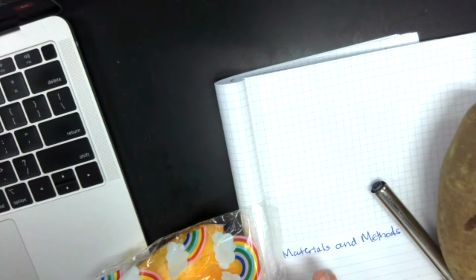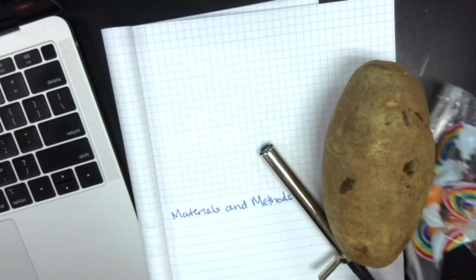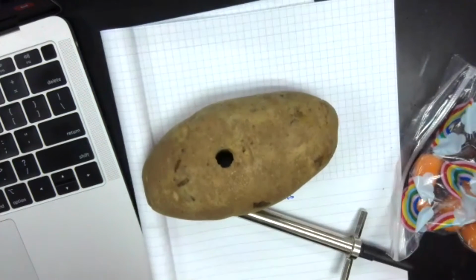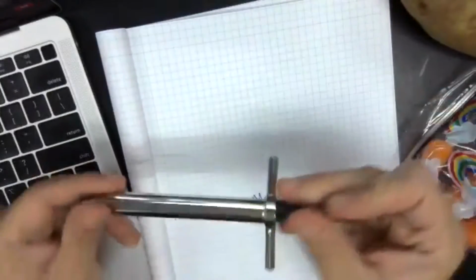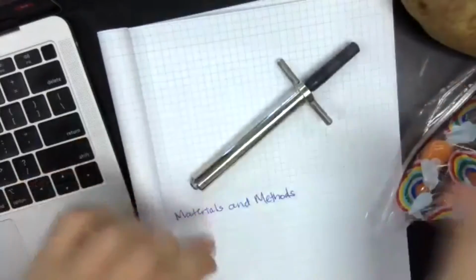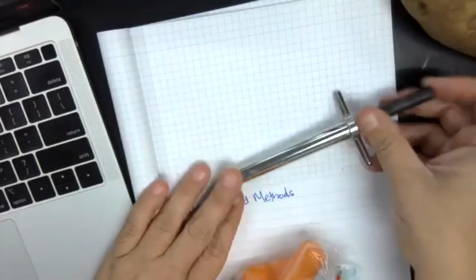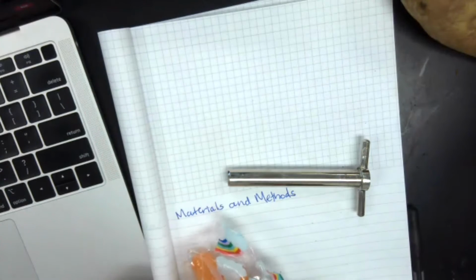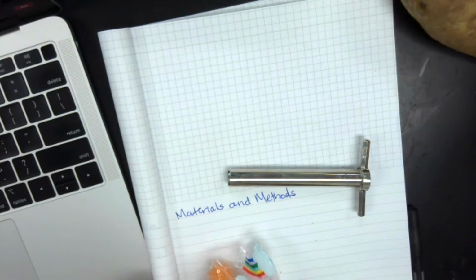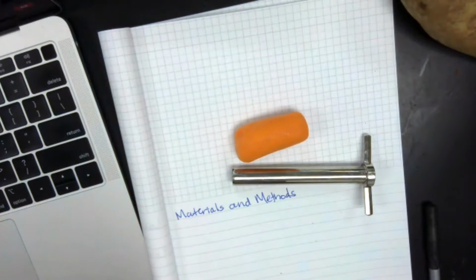All right, so what you're gonna do is take each of your vegetables and cut out 6 cores from the vegetable. To do that, you're going to use this thing called a cork borer. You should have a little needle, and you could use the handle of the needle on your desk already in your bins. You are going to use that cork borer to cut cores out of your vegetables.